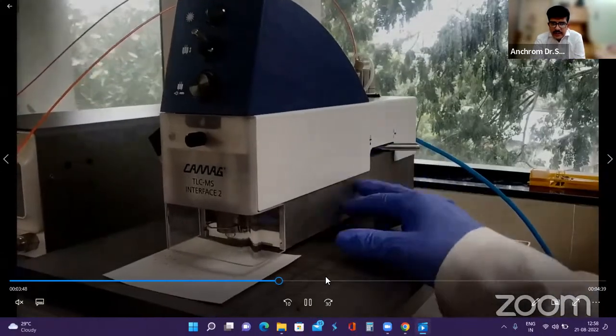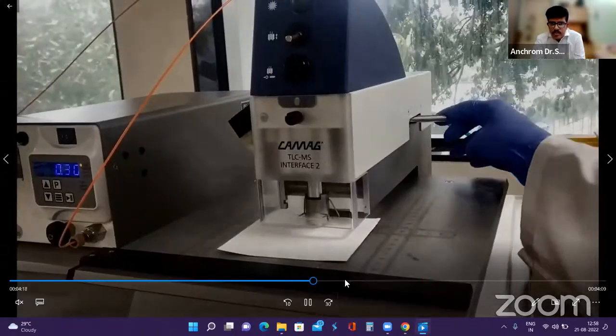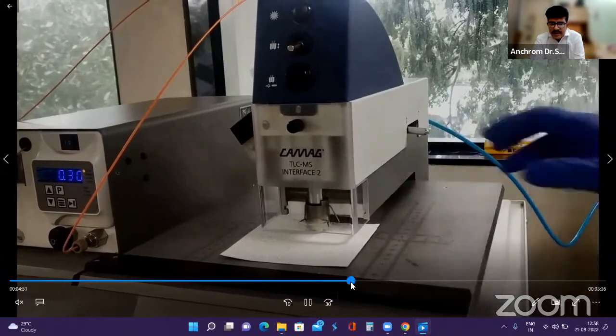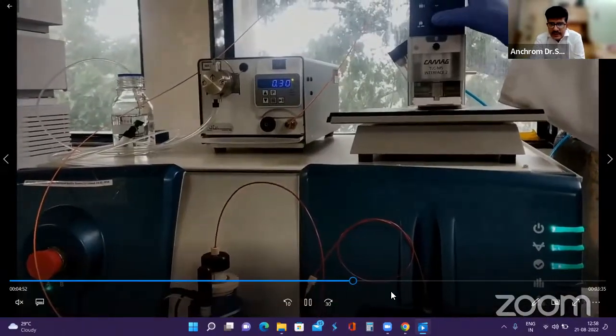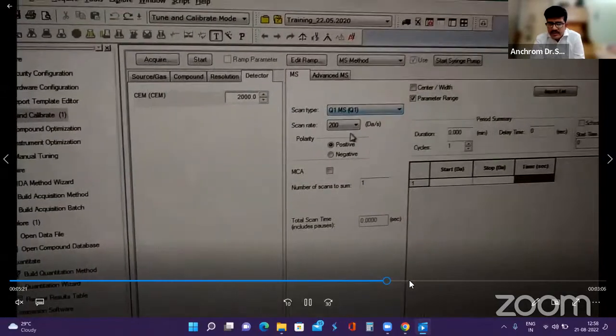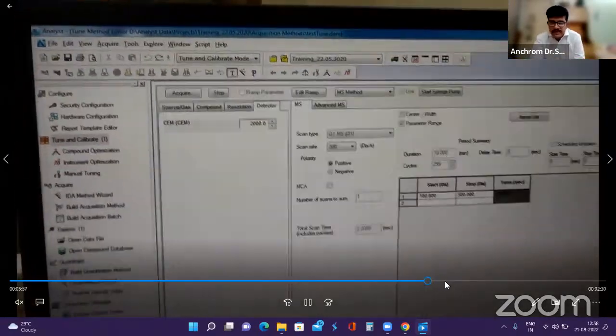And this is how the connection is made, and on the right hand side, this is the lever which you are seeing. So when he pulls this lever and the extraction is being done, it is sent into the mass. And after it is done, these are the spots which are being tested. That is the caffeine sample. The parameters of the detector have to be known before you inject them, and that is where the tuning part comes in.